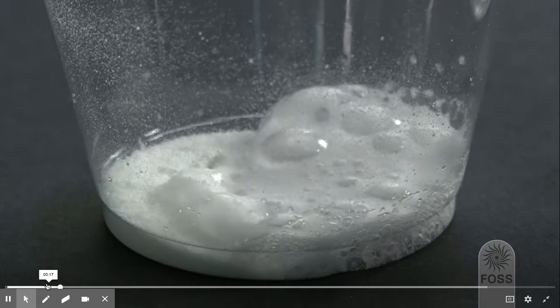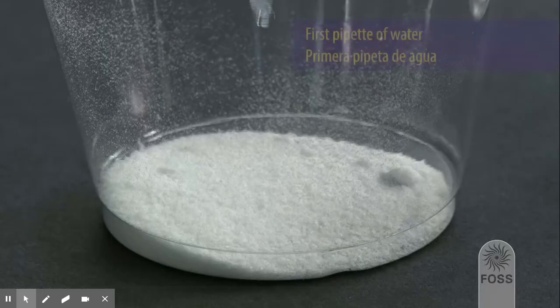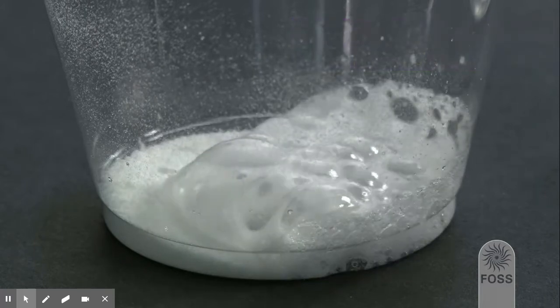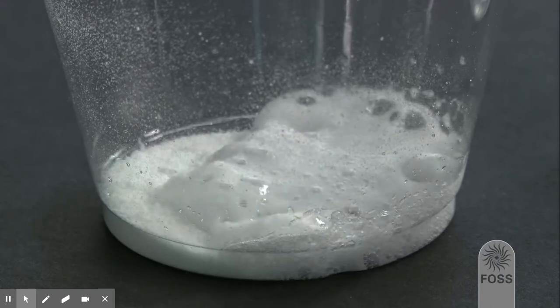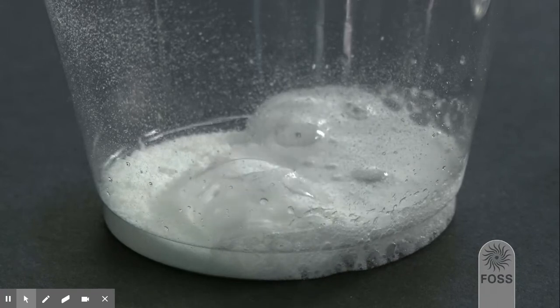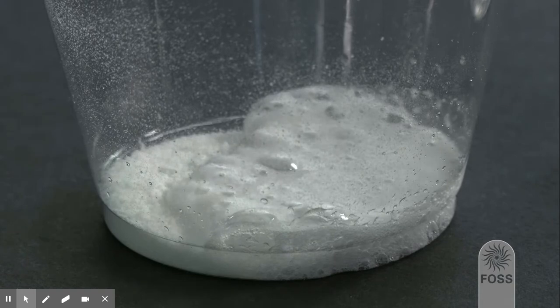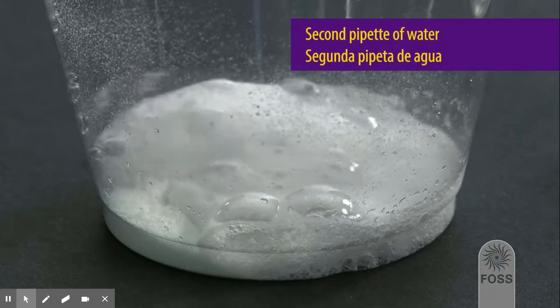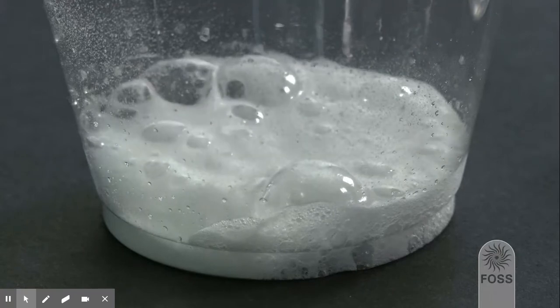So again, let's rewind a little bit. You're watching to see what happens when water is added. So now they just added more water — the second pipette, meaning the second pipette full of water.